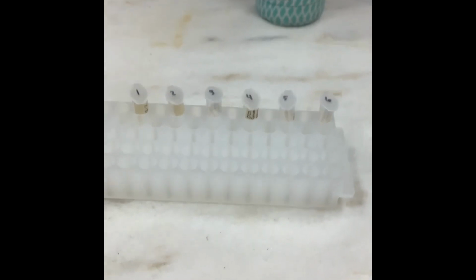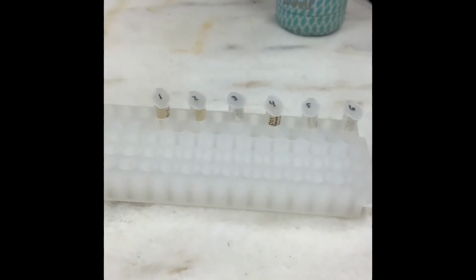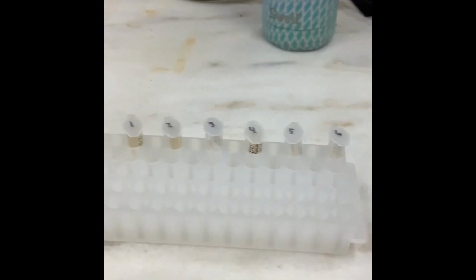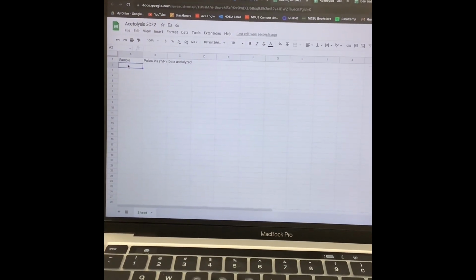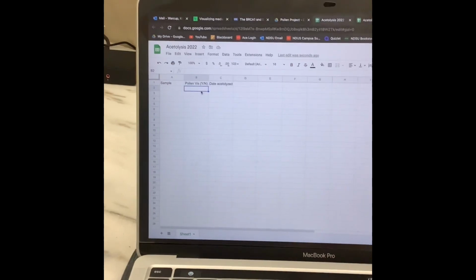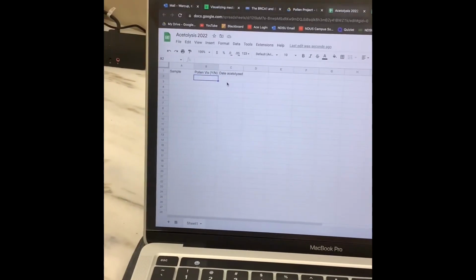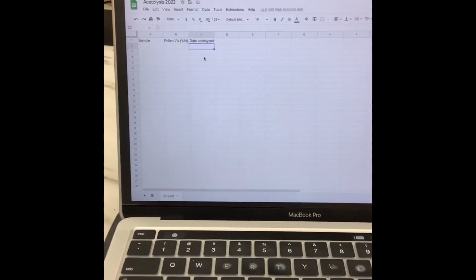So the next thing you're going to do to your samples is you're going to just arbitrarily number them. So 1 through 6 for these samples, but you can go up to 12 or 18 depending on how many you want to do. So next you're going to make a spreadsheet or use the spreadsheet that's already made, and you're going to type in your samples, whether or not pollen was visible on the Q-tip, just a yes or a no, and then you're going to put in the date that you're going to acetolyze the samples.